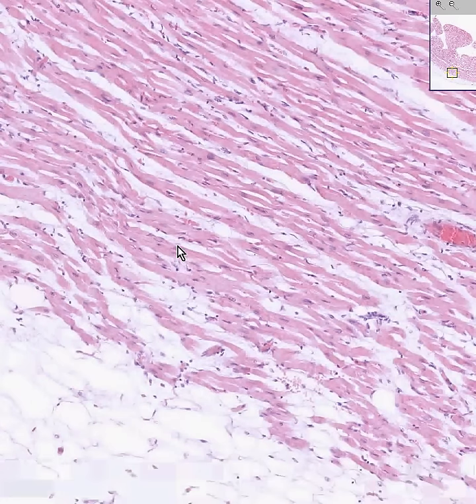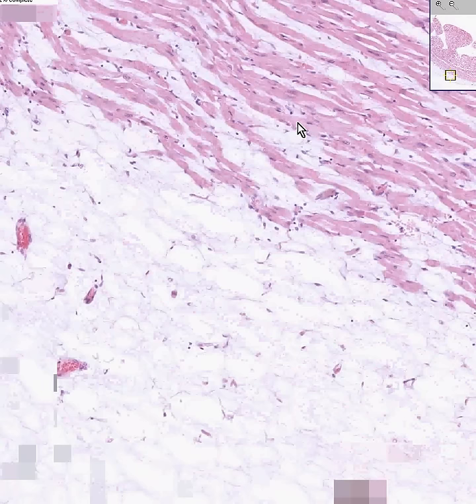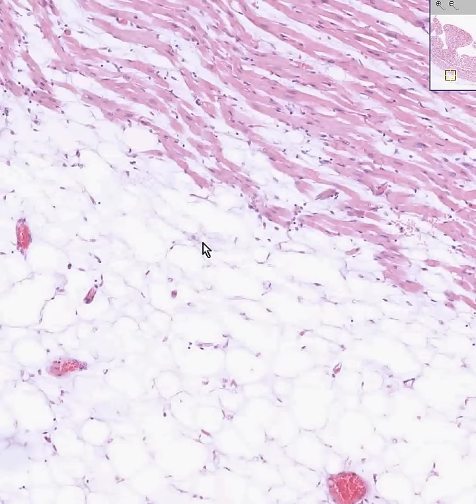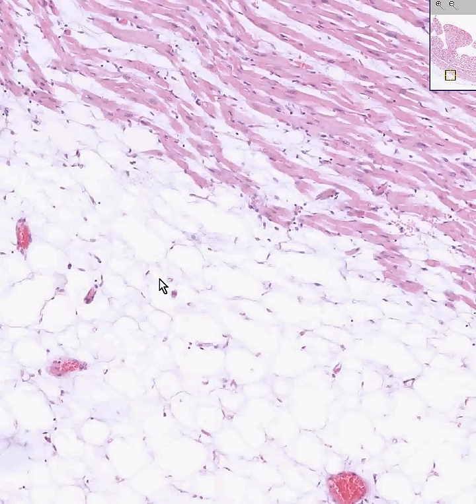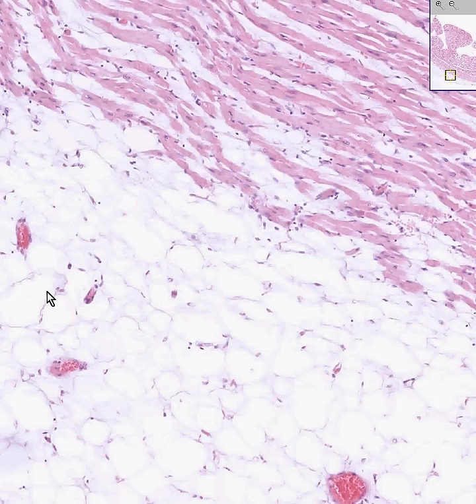Like the adventitia, the visceral pericardium is once again very loose connective tissue and largely fat. In addition, the very large arteries of the heart travel within this loose connective tissue layer — all of the major arteries of the heart travel in pericardial fat. So the epicardium or visceral pericardium would be considered the adventitia of the heart.